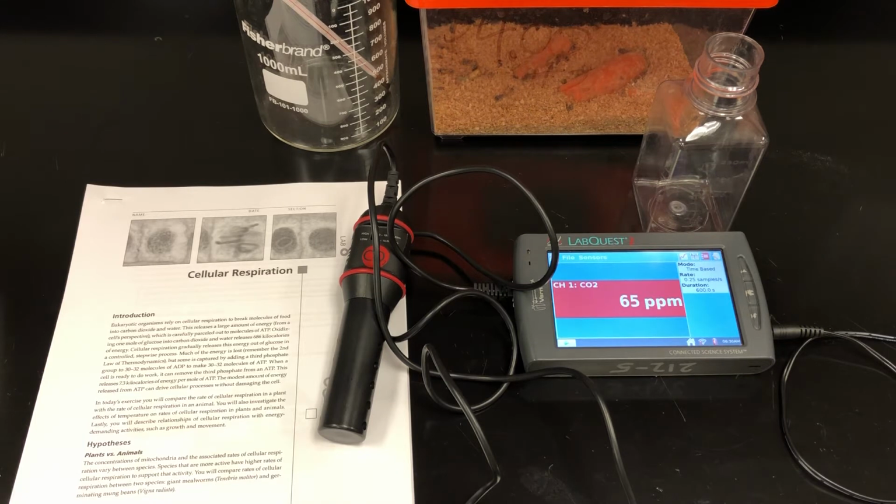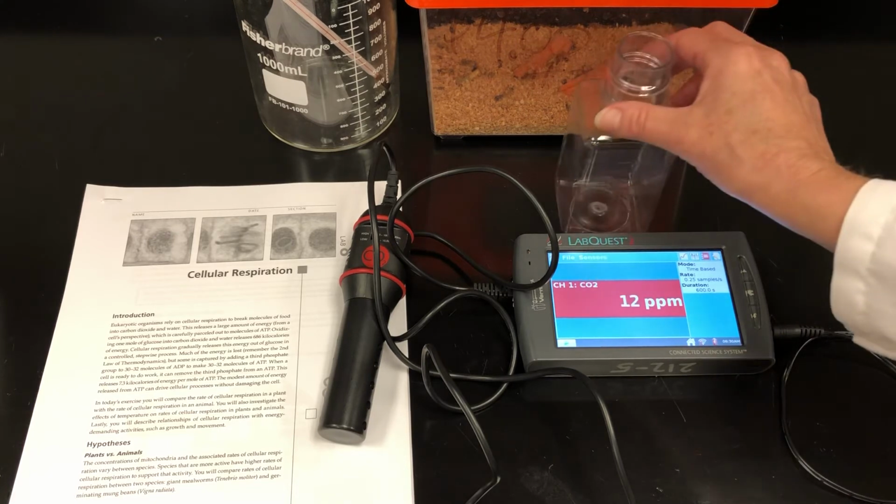And then for a plant, I'm going to be using bean sprouts, what they call mung bean sprouts, because when beans first sprout, they don't have any leaves. So they cannot photosynthesize. When you think about it, when seeds sprout, they sprout under the ground. So they're carrying on respiration. They're not doing photosynthesis, they're carrying on respiration. So in a little while, I'm going to go get some fresh bean sprouts, and we'll use that for the plant portion of the lab. But the way we set this up is we'll put our organisms in here.